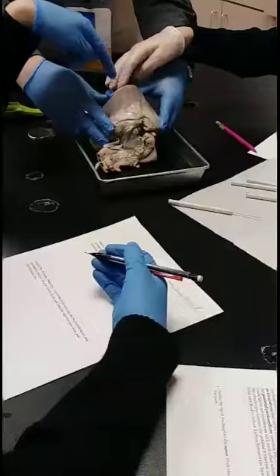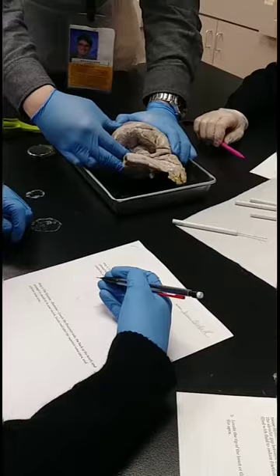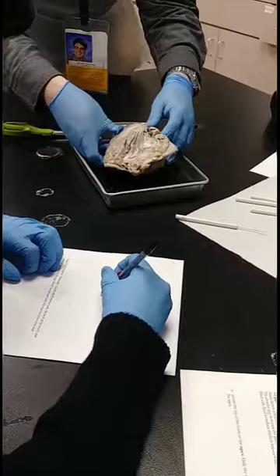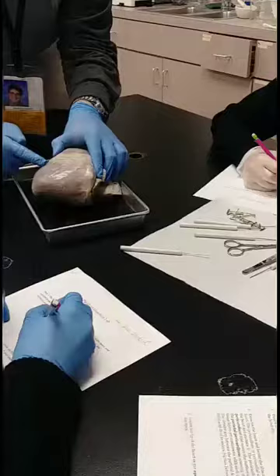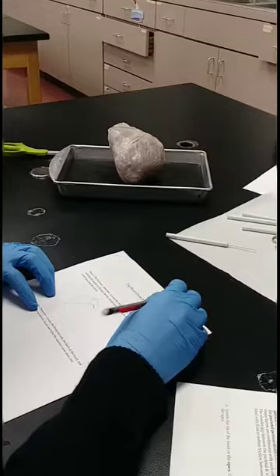Other side. Sometimes the heart is damaged, I don't know how they collect it, but this is just a little hole. That's all it is. Make sense? Interventricular groove. Okay, open up your scalpel.